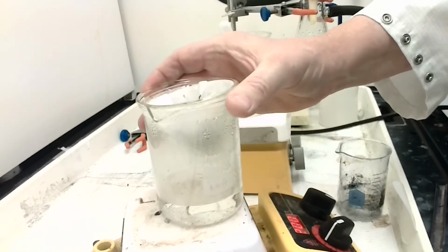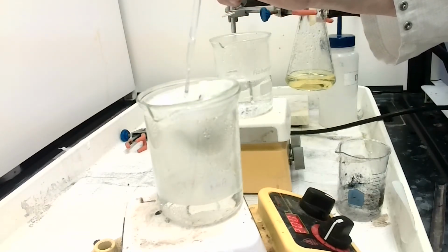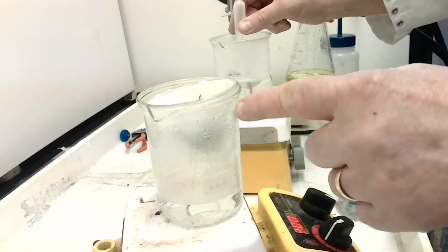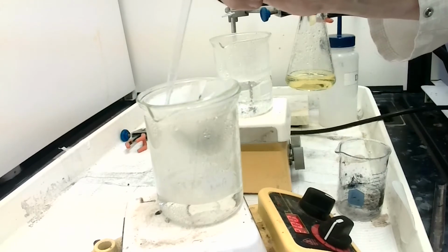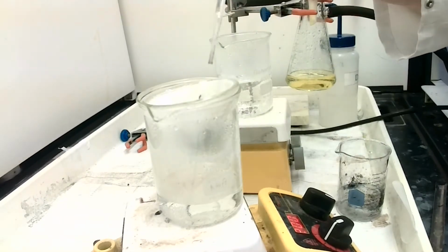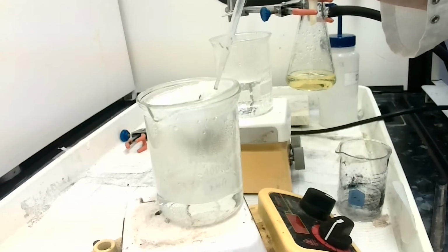I look inside. I can see those edges are looking a little sparkly, so what I'm going to do is squirt down the sides of the paper, just again with boiling hot water. And the goal is we want all of our product down here in the filtrate, none of it stuck in the paper. And another goal is to not use too much water. So there's a fine line on too much versus losing all your product up in the filter paper.